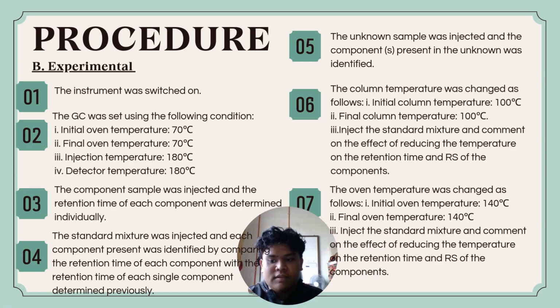6. The column temperature was changed as follows. First, initial column temperature 100 degrees Celsius. Second, final column temperature 100 degrees Celsius. Third, inject the standard mixture and comment on the effect of reducing the temperature on the retention time and resolution of the component.